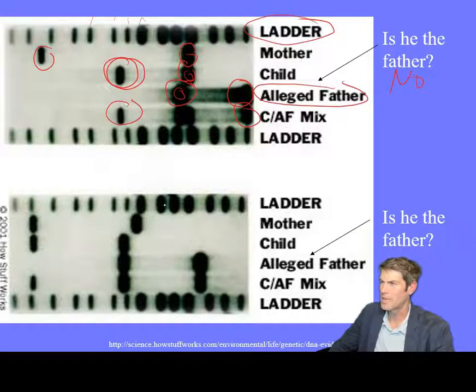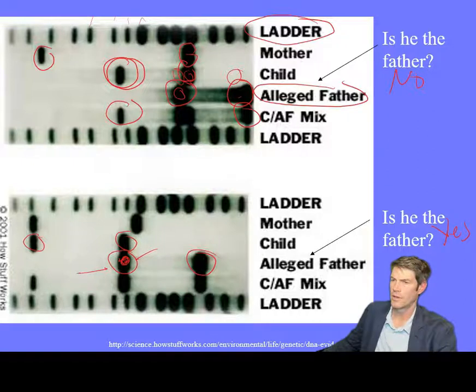So the father doesn't have any, there's nothing here. It's not matching up. Now down here, here's the child. Got these two. And here's the alleged father. Ooh, right there we know. Here, father is yes. Top one is no.